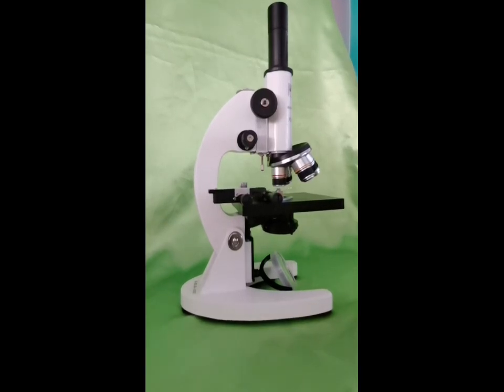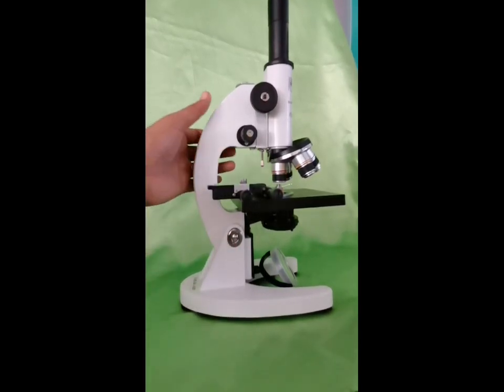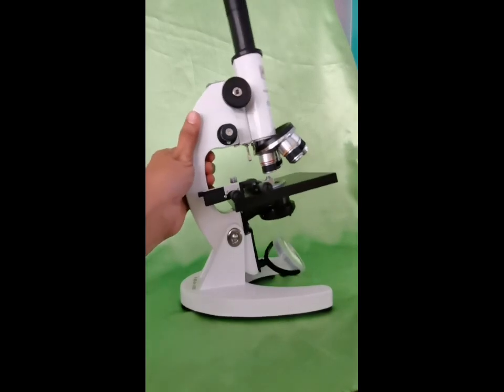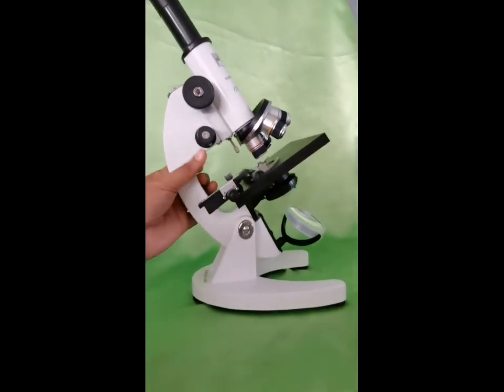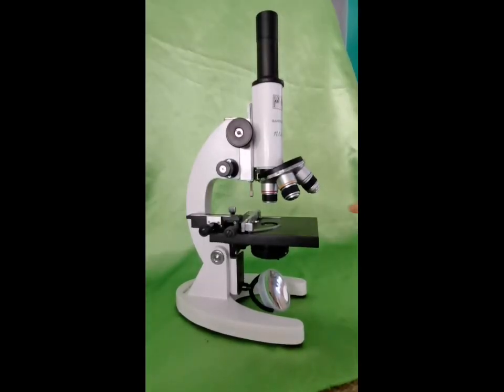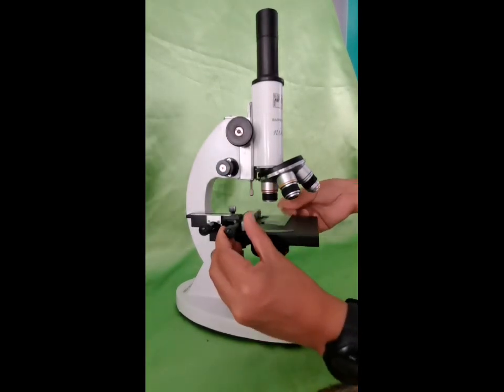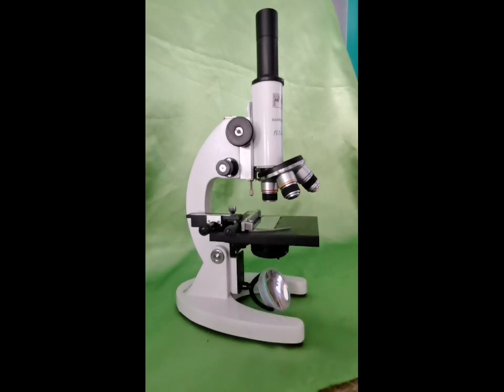The next one is the inclination joint. It is a movable hinge that connects the arm to the base. It is used for tilting or inclining the microscope when necessary. Number 4 is the stage. It is a platform that is connected to the arm's lower end. It is where the slide is placed. It has a central opening that allows light from below to pass through the specimen.